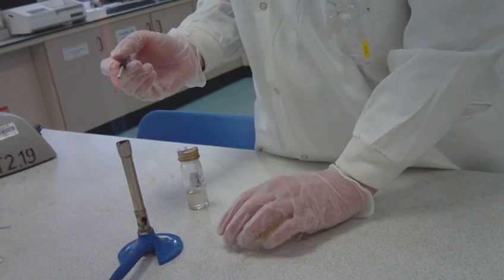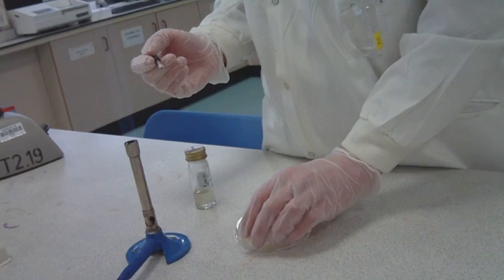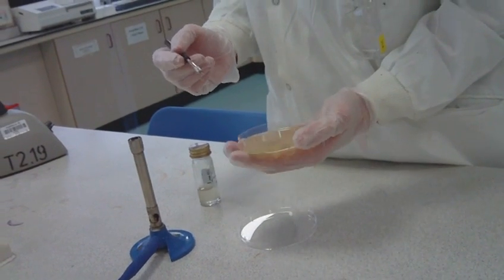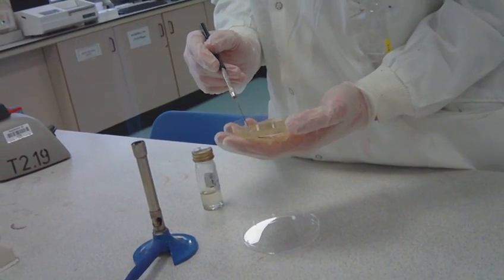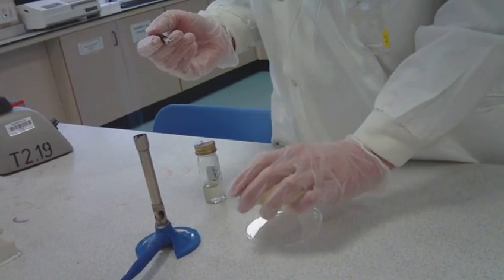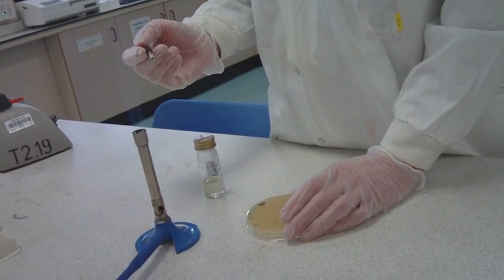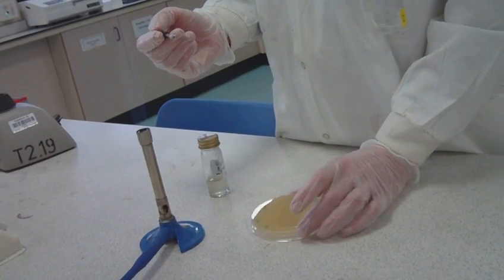Reflame the inoculation loop. In the last quarter of the agar, streak the bacterium in a zigzag formation towards the middle. Be careful not to streak the bacterium where you have previously streaked as it will not give the desired separation. The zigzag should not touch the sides of the petri dish.